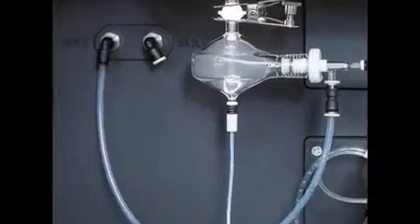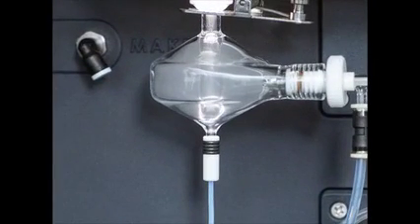That aerosol is pushed into a spray chamber. The purpose of the spray chamber is to filter out the largest droplets, so we get a moderately uniform droplet size, all heading towards the next part of the sample introduction system, which is the torch, which houses the plasma.